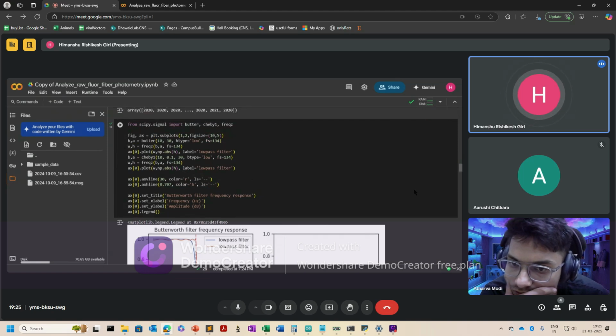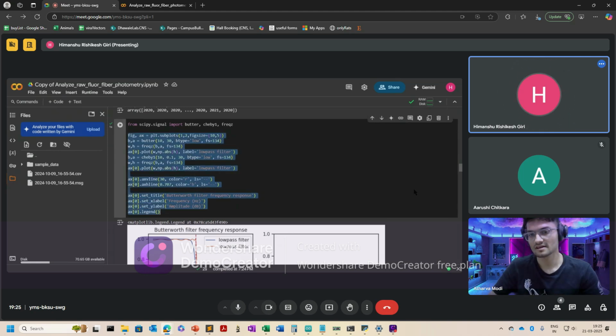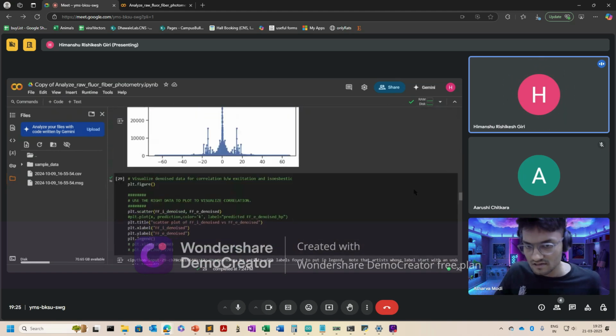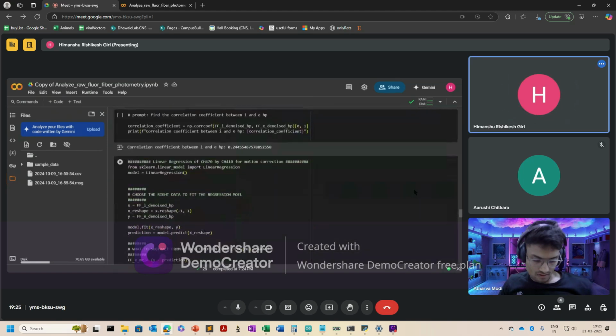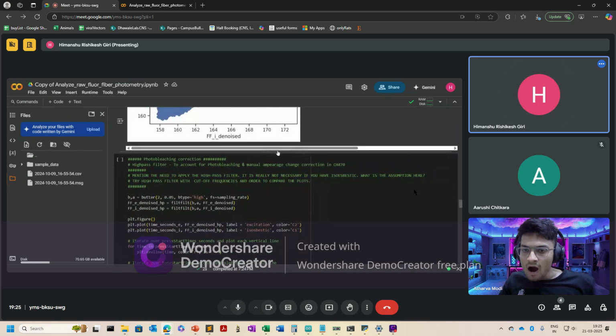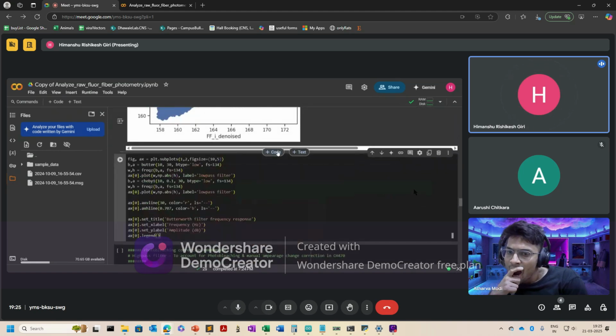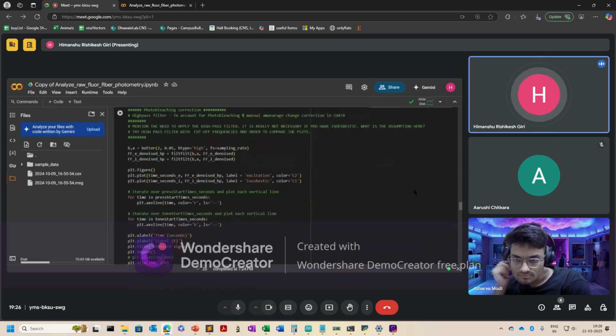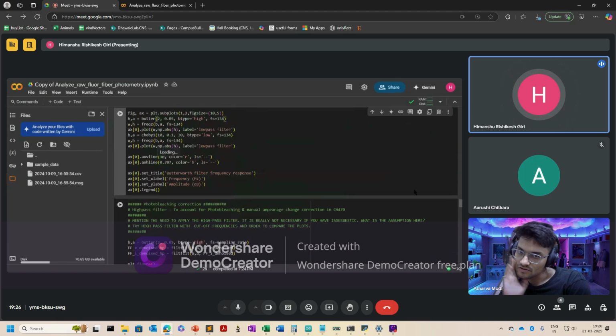Make it high. 0.05. It's a second order filter. Second order. Okay. Yeah, this was a second order.